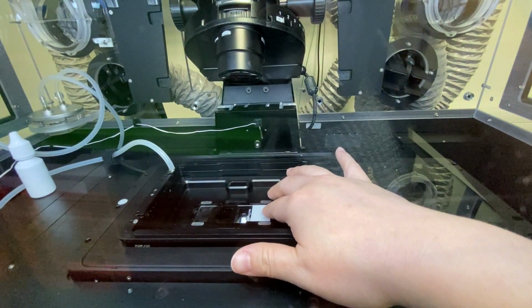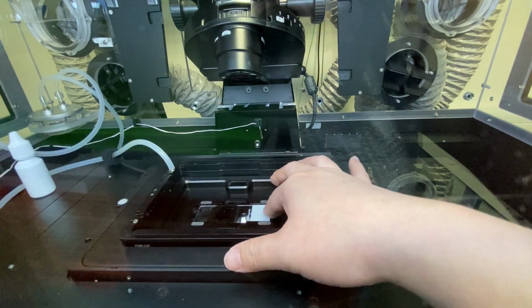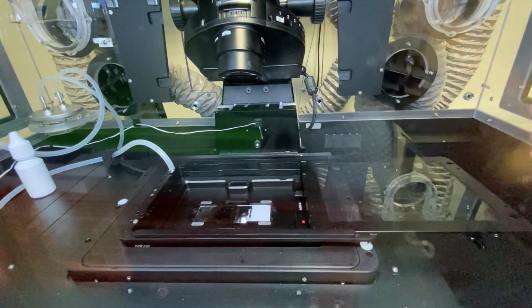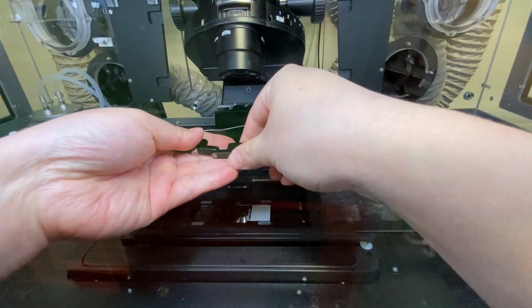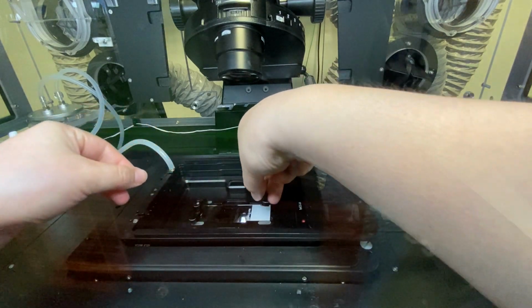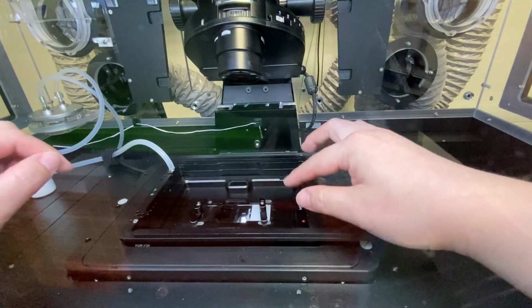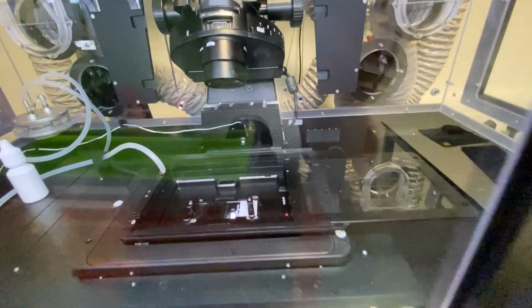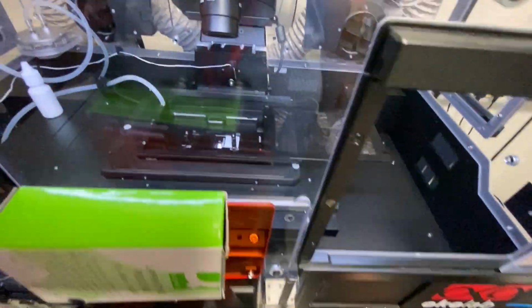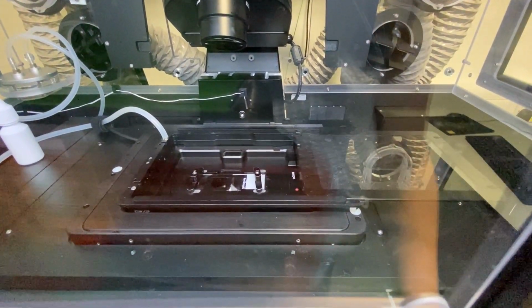If location is very important to you, then make sure you push your slide, which can wiggle, into one of the corners on the slide holder. And then you want to clip your slide down. Make sure it's clipped down on both sides. And now you want to use the joystick to move your lens underneath your cover slip.